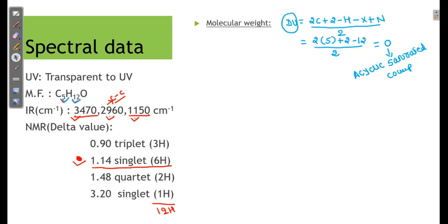I come to the conclusion that with the help of oxygen, the possible functional groups are OH and ether only, because in the case of carbonyl, a degree of unsaturation of 1 is required. But in our compound, there is no DU of 1. So these two are the possible functional groups which I can see.